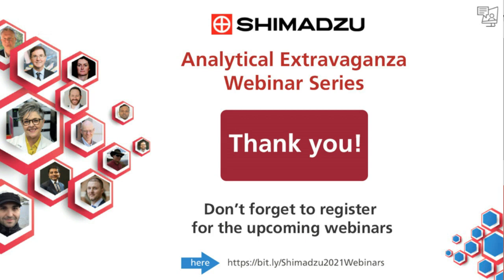Great, thank you. What is the role of the ICP in ICP-MS?